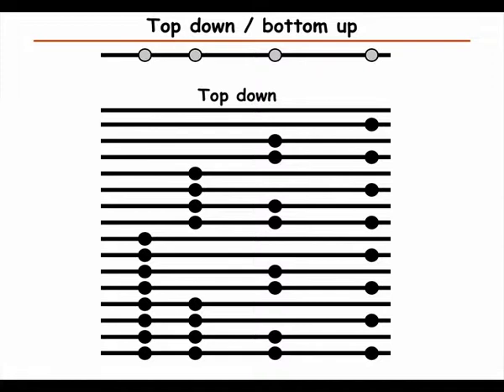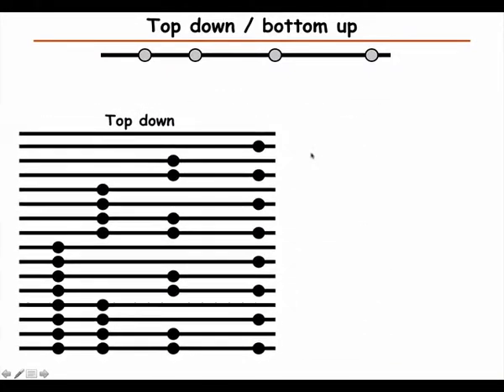So, for example, if we do top-down measurement of this, so this is, let's say, a whole protein with 4 sites, then we could measure each of them, and there will be a lot of possibilities we have to try, but we could look at the correlation and see, for example, how often we have this modified here and there. While when we do the digestion, we wouldn't see that.